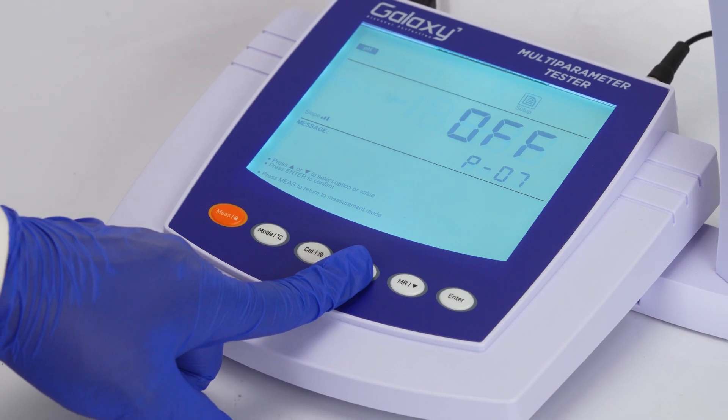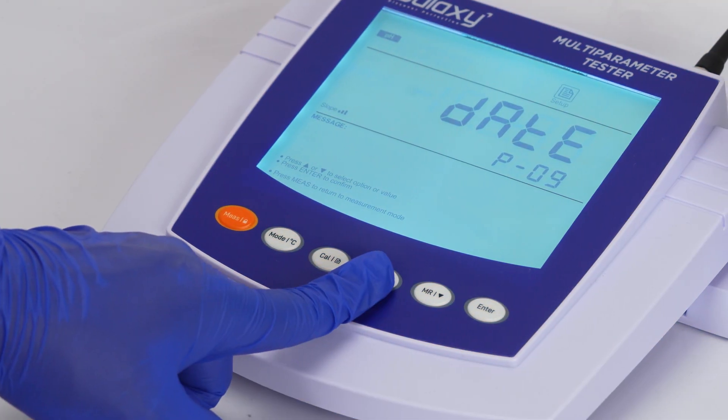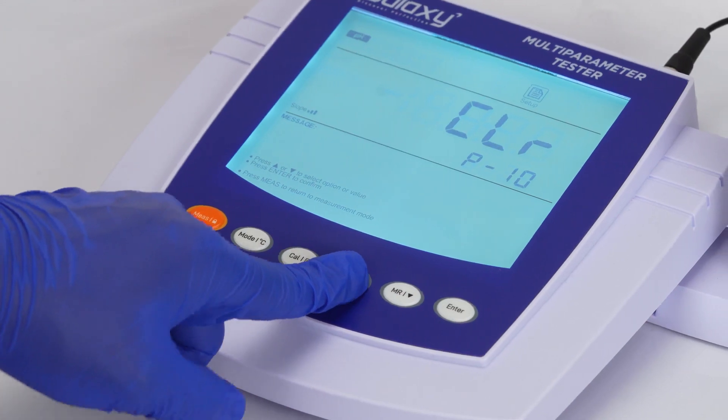Additional settings include auto power off, calibration due reminder, date, clear, and factory reset.